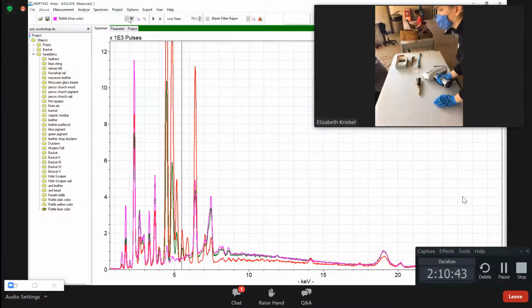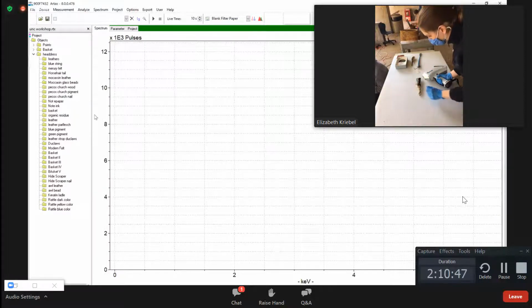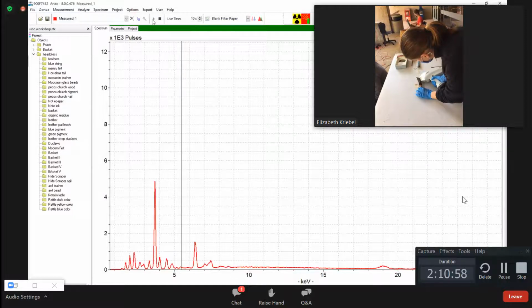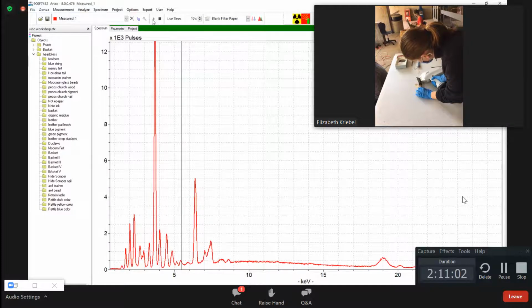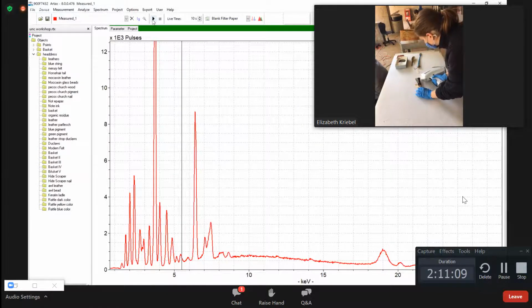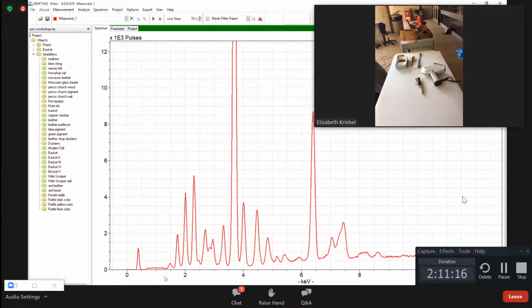The blue is ultramarine, by the way, because of the aluminum and silicon. And then black, I'm going to guess bone black. So if we see a lot of phosphorus and calcium, but let me know when you're ready. Ready. Starting. Yeah, there's the calcium and there's the phosphorus. So this is bone black. Bone black is where you basically burn a bone, grind it up, and mix it in some base like linseed oil. You can tell that just like we could tell the bones earlier, by all of the phosphorus that's present. Which means this is on the older side, I'd guess, because bone black is not really something you'd make in the 1950s. You'd have other alternatives available to you.